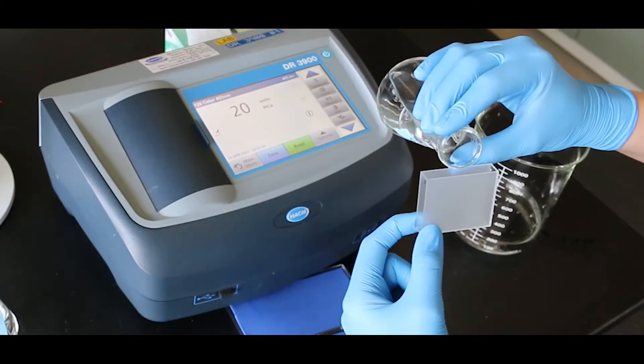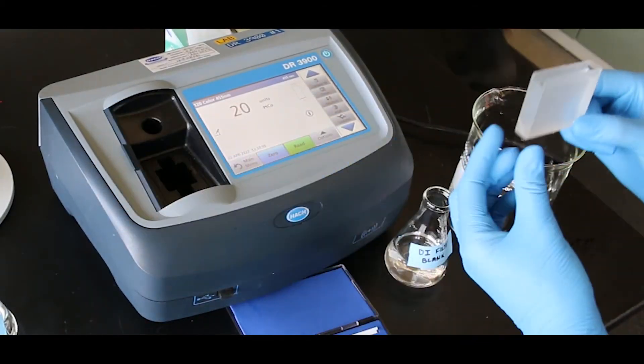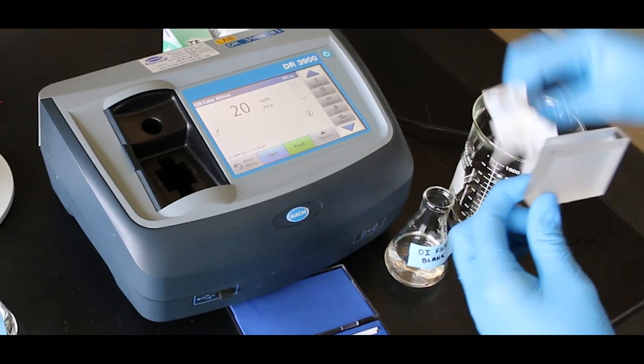For very low levels, a rectangular cell with a longer path length can also be used. See method for details.